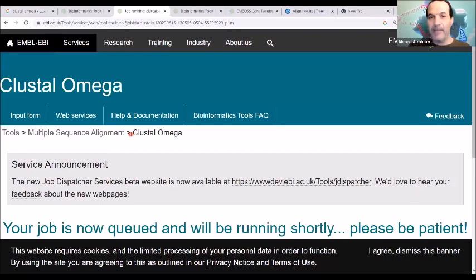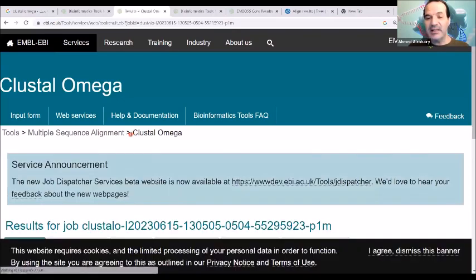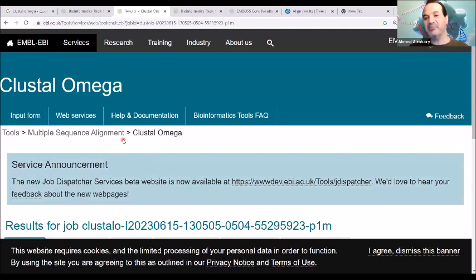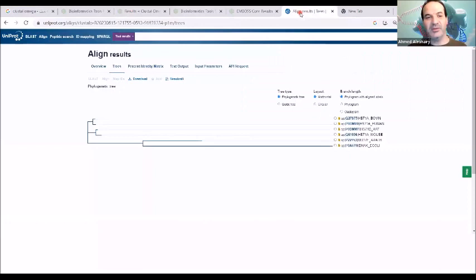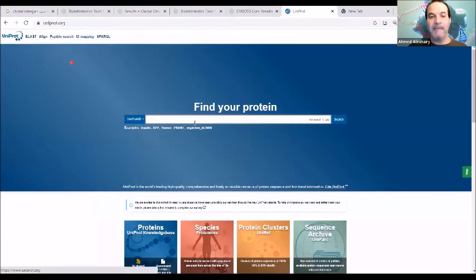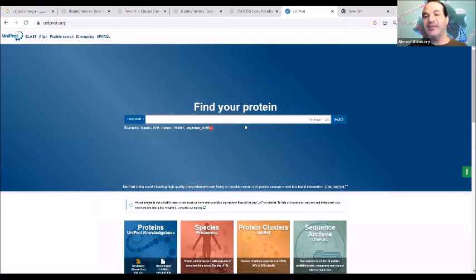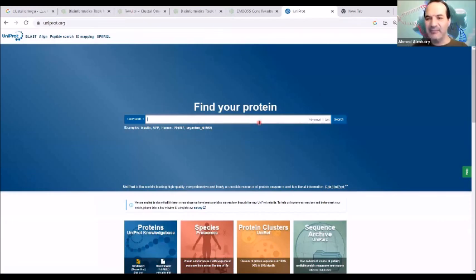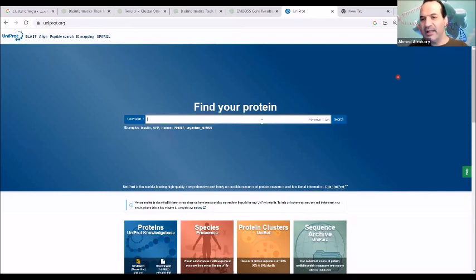This is Cluster Omega and the API website. What I will do to get the information you asked for is go through Uniprot. Uniprot is a very important and easy website that uses Cluster Omega, and you can extract a lot of information from it, including what you just asked.